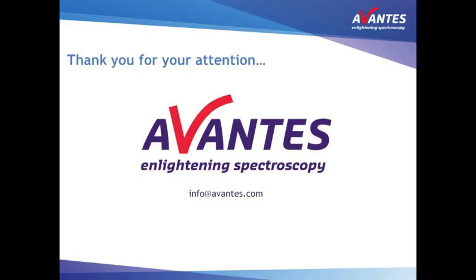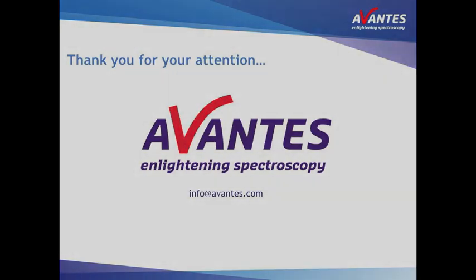This concludes the periodically save option in Avasoft. We hope you will find this tutorial useful. Please check out our other videos as well.